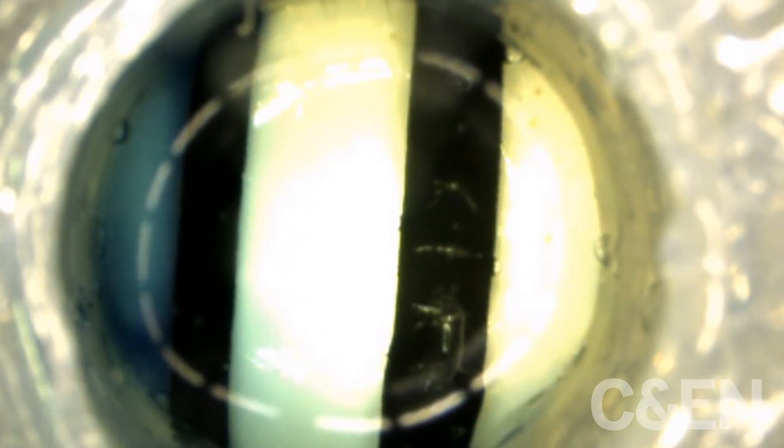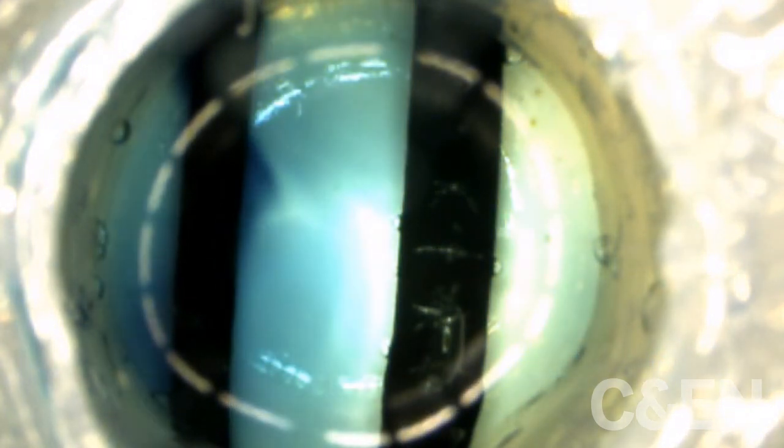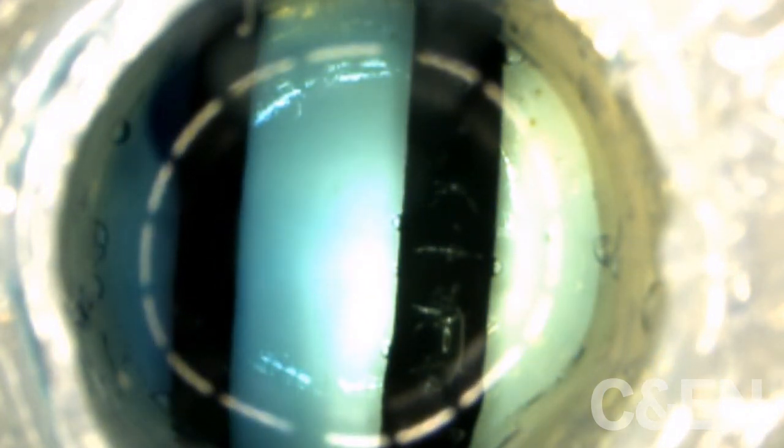As the compound was reduced, it turned blue, as seen through a viewing window.